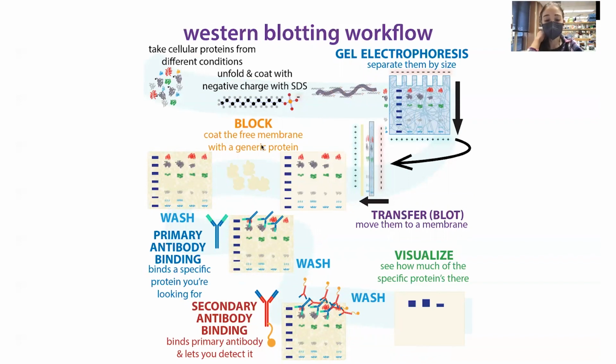So if you do something like a pull down where you take the protein and pull down anything that it's bound to, you isolate the protein, and when you pull it out of the cells, it's going to be bound to other stuff likely. With the pull down, you do some washes, but not super stringent, or else you'll lose everything. But it's important that you have a high enough salt concentration that the really weak interactions get lost.